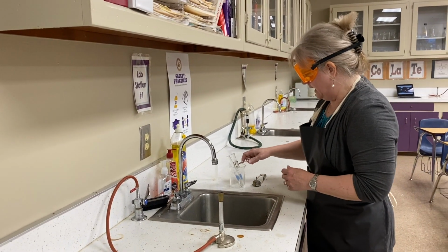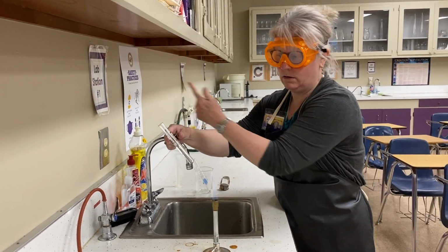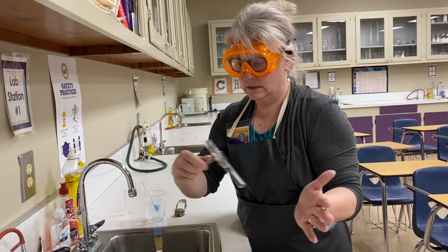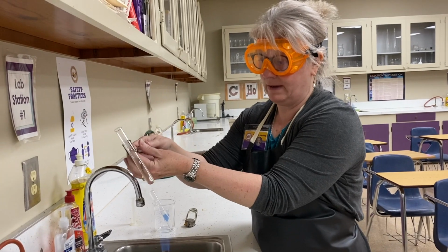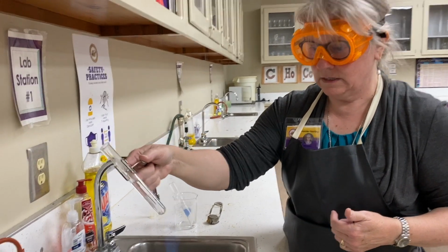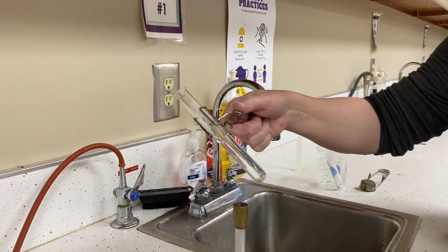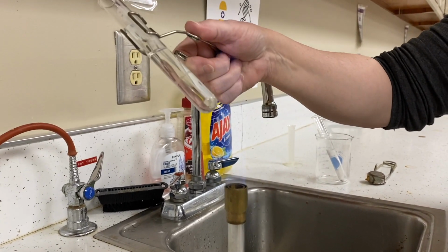Okay. As I begin, I want to point the test tube towards the wall. I never point it at myself, and I never point it at someone else. It always is pointed to the wall. And I want to keep my hands about halfway back behind the pinch area of the clamp. So I lower it into the flame, and I keep it moving. I run it up and down the length of the tube.